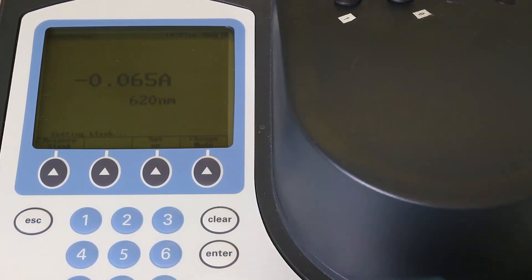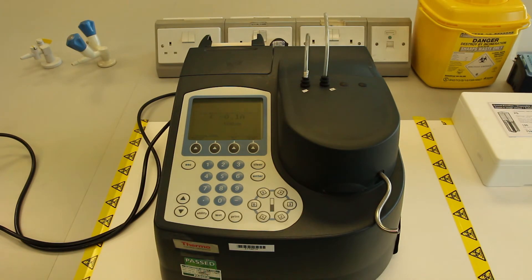Then press measure blank. This will zero the device, meaning that all absorbance or transmittance measured in later samples will be solely due to the sample you are interested in.